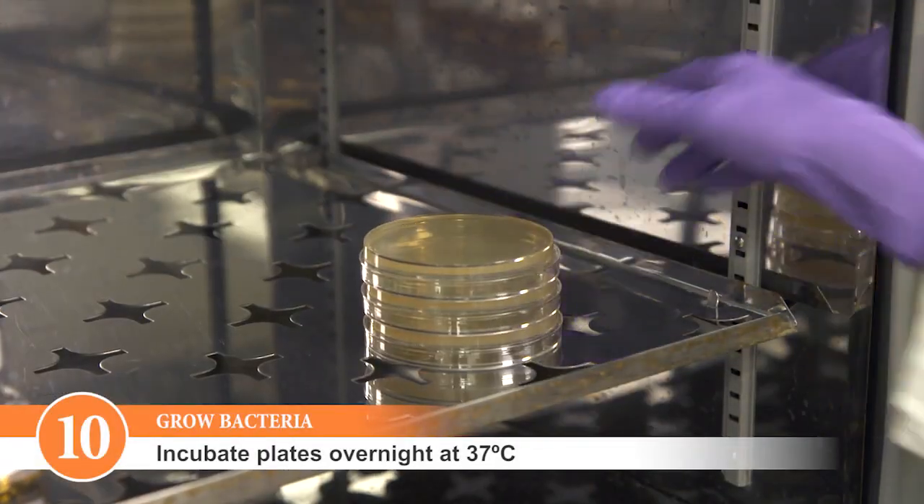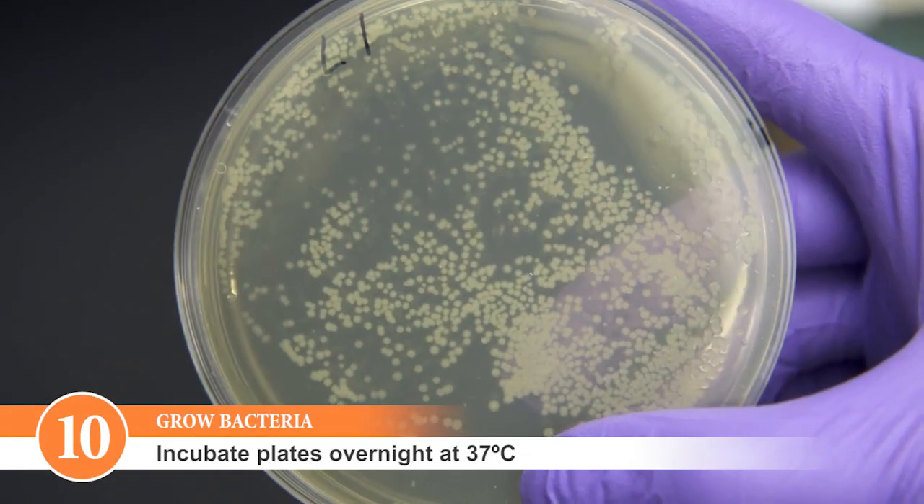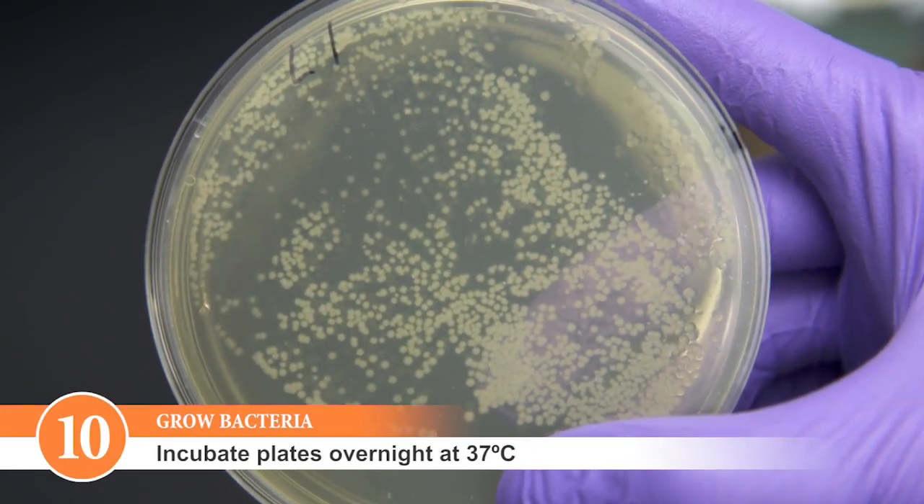Incubate the plates overnight at 37 degrees Celsius. You should have colonies on your plate by the next morning.